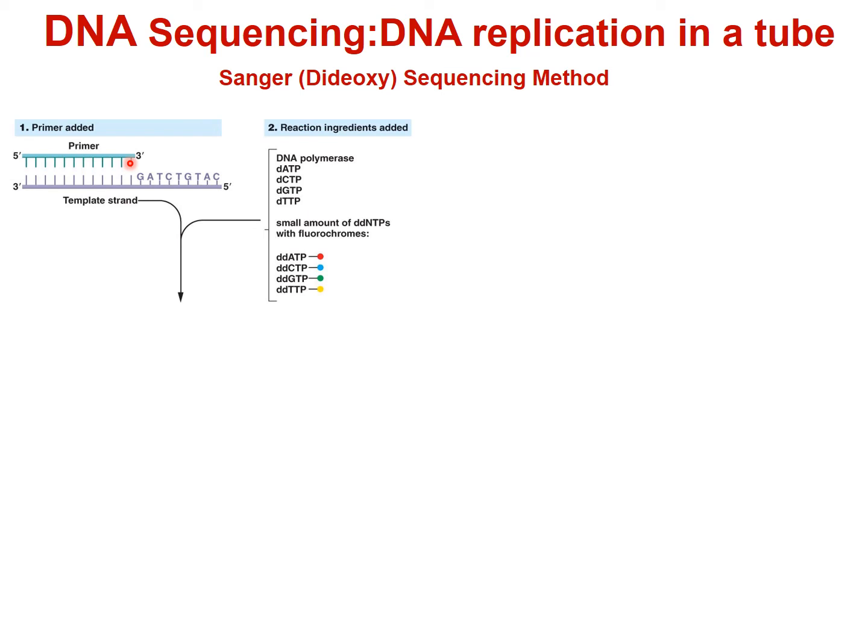We'll provide a primer for sequencing. Now this will be the same primer that we use in our PCR, right? So this will be one of the same primers. And what we want to do is determine the sequence that's shown here. This will be the sequence of the ribosomal RNA gene. So the primer is 5' on the left and 3' on the right, and so this can be extended by DNA polymerase.